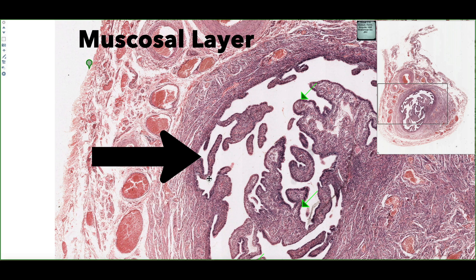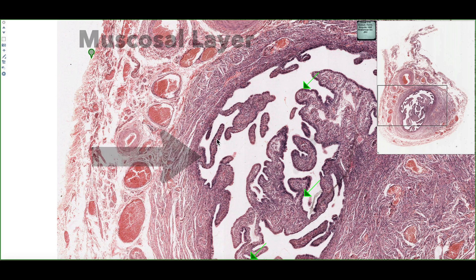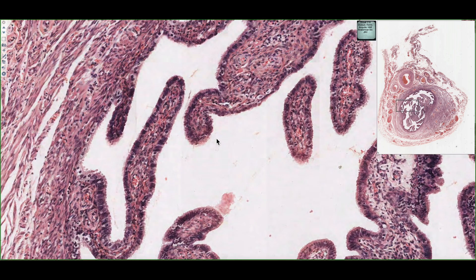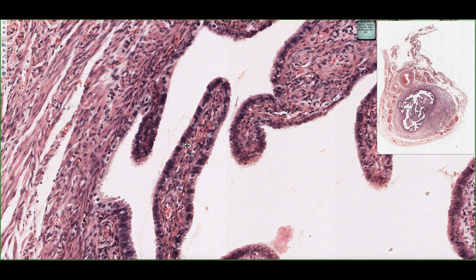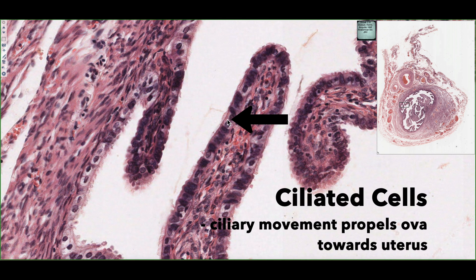The oviduct has two distinct cell types. If we look at this mucosal fold in the center of the screen and zoom in, we can clearly see the two cell types. We can see cells that have cilia projecting from their apical surfaces. These are aptly named ciliated cells, and they help propagate the ova as it's released — brought in by fimbriae into the infundibulum and along the ampulla — brushing the ova towards the uterus.